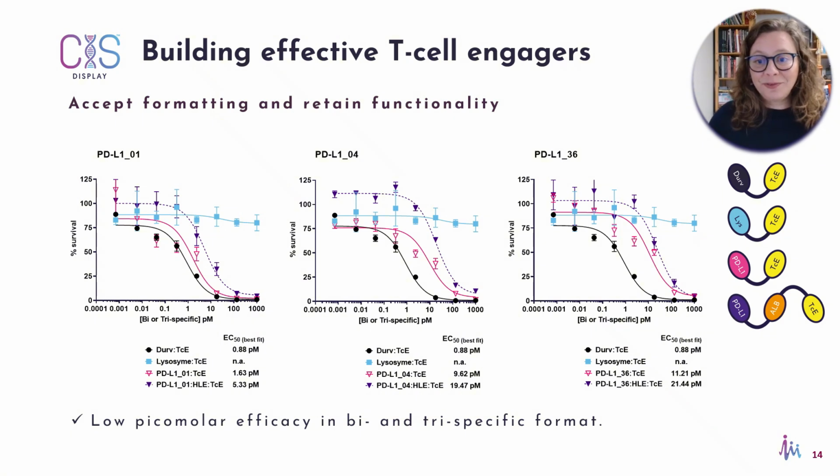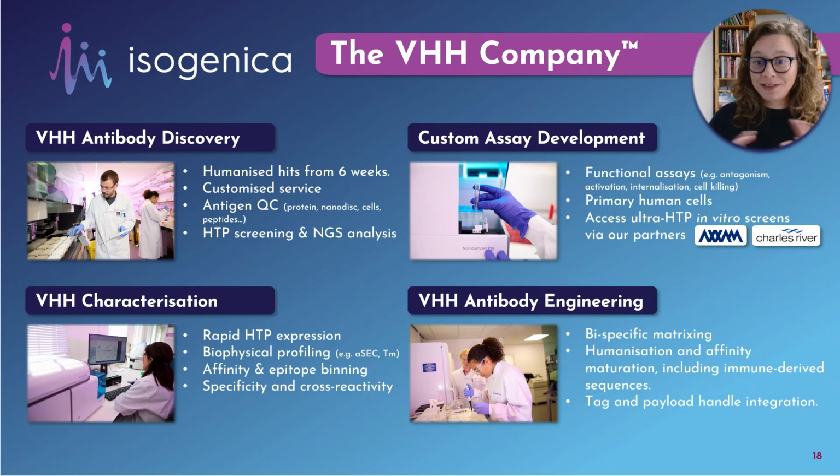So these VHHs come directly from our library. No engineering, no optimization was done to it. So the potential is huge. Just a summary of what I've presented to you and some additional notes.